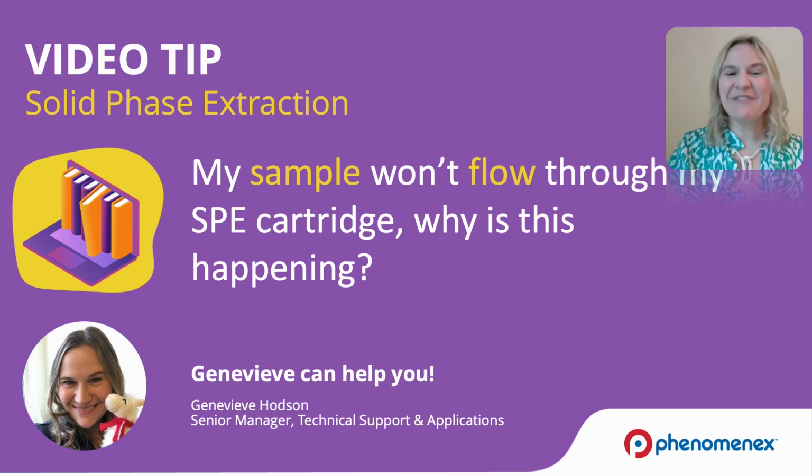Today we're going to be covering another solid phase extraction troubleshooting tip. The customer question today is, my sample won't flow through my SPE cartridge. Why is this happening? It's a great question. Let's take a look at a few common reasons that this can happen.